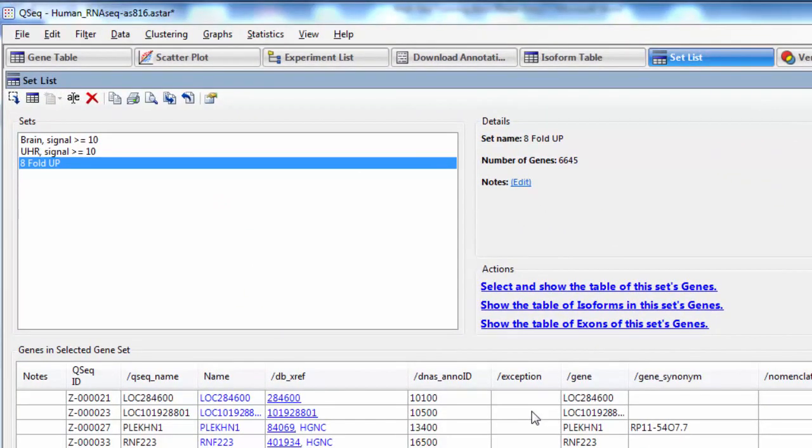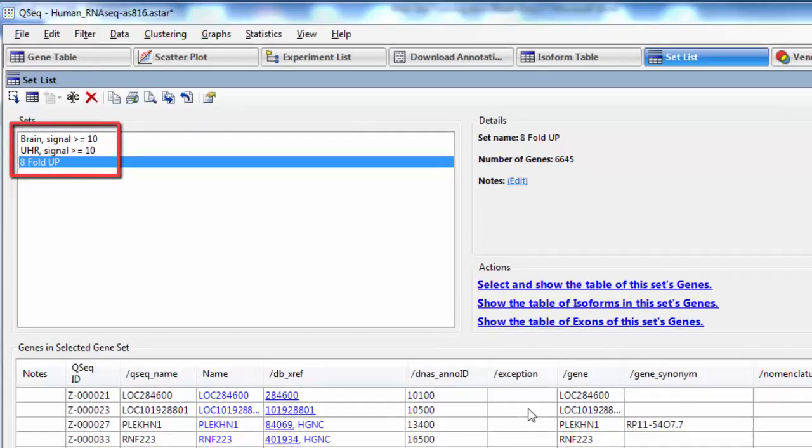After clicking OK, I'm taken to the set list view, and I can see my new gene set in addition to the two that were already created.